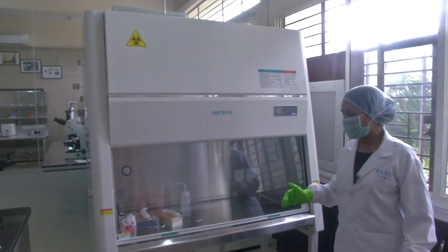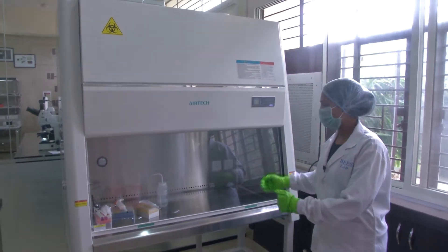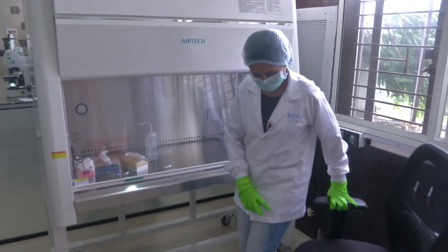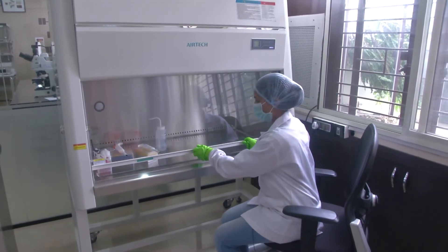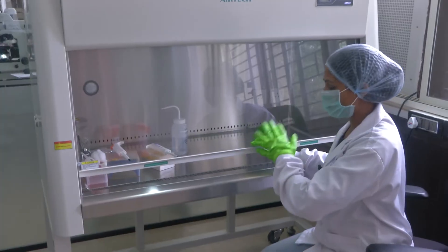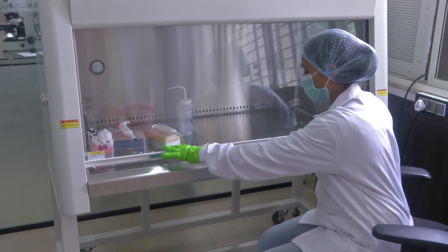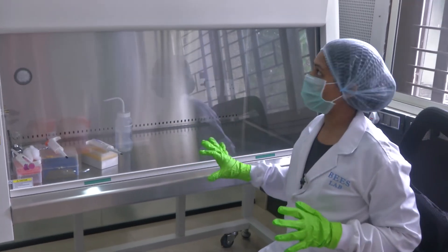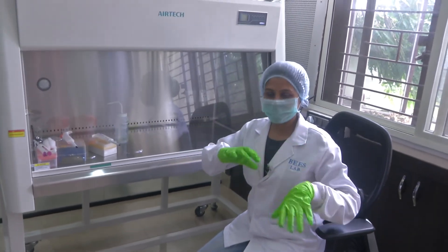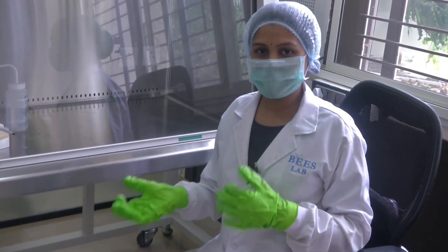The last and most important equipment in the biology section is the biosafety hood. This is a Level 2 BSL hood and there are different levels and classifications which will all be discussed. It becomes important how you use the biosafety hood while working — the sash should not go beyond your hands; you sit here, have the sash open, and only your hands remain exposed at that level so that there is no aerosol or other sort of contamination which could affect you. This was all about how the biology section and the characterization facility are equipped with different equipments. Let us see how to use them and going forward we will see how to fabricate devices and how the facility can be used. Thank you.